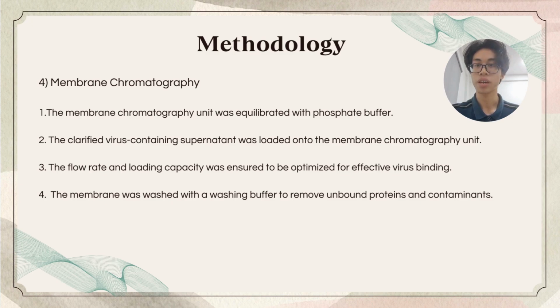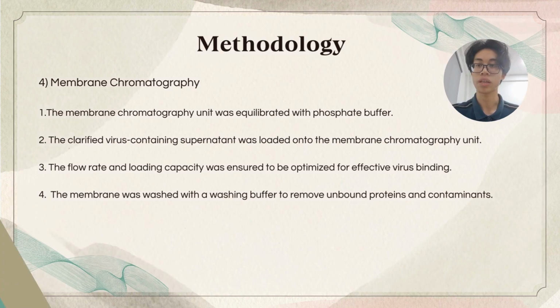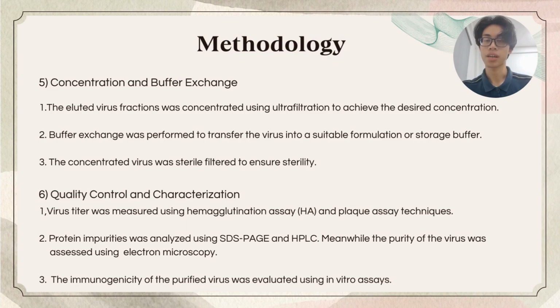To remove any unbound proteins and contaminants, the membrane was then washed with a washing buffer. This process ensures a purified virus sample for subsequent analysis. The fifth step is carrying out concentration and buffer exchange.